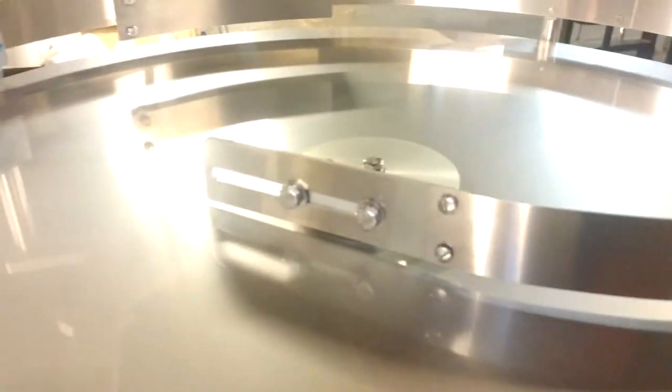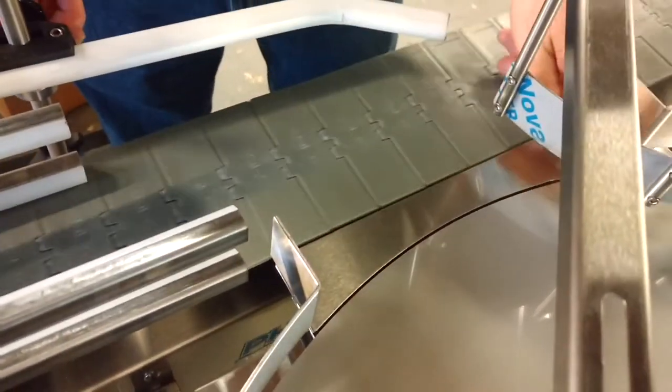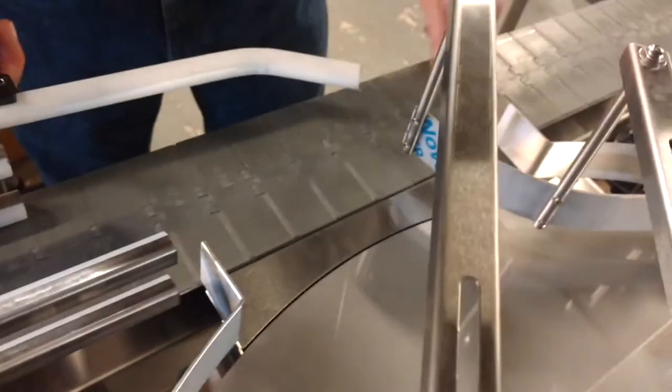And then your dead plate here — you want this side lower than the belt so it doesn't hang up, and this side a little higher when you're coming off so it's not tripping on the belt.